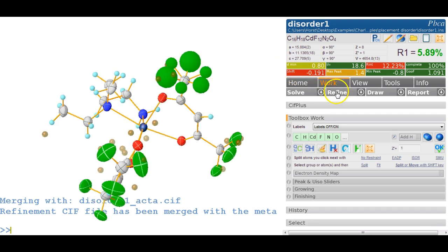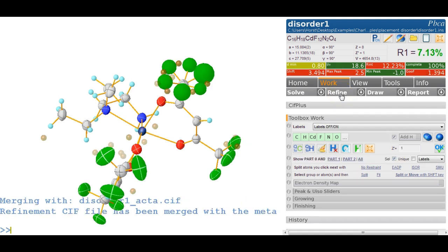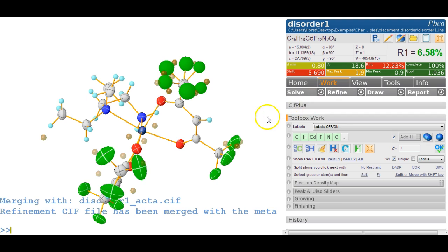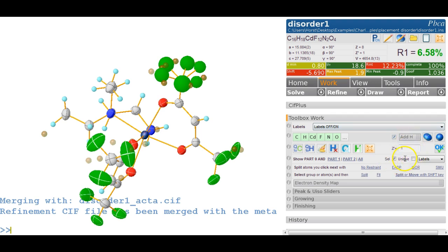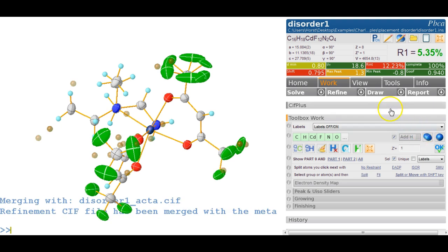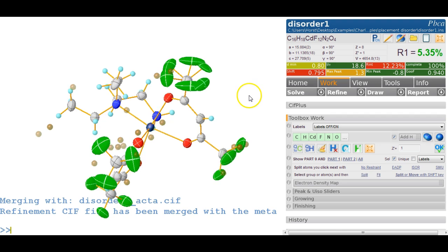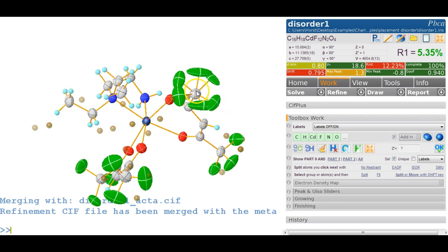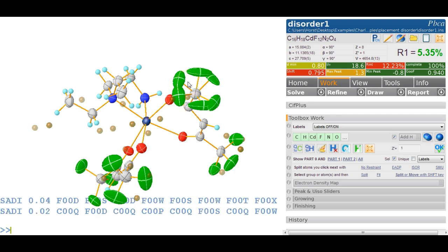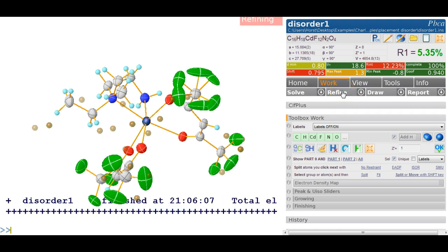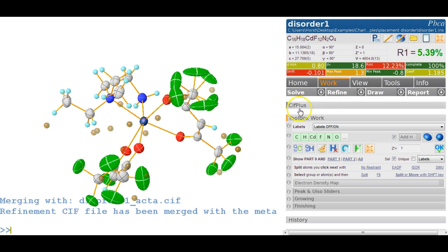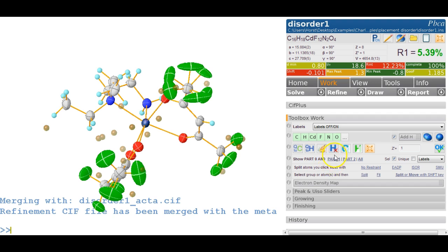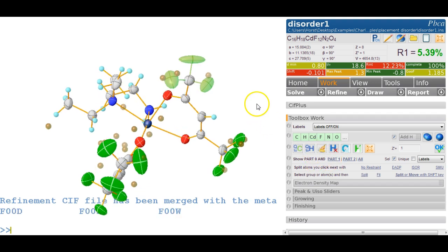Now we have the disorder set up and we refine it several times - the refinement works out really rather well. Let's go anisotropic by clicking on the ellipsoid button again. The ellipsoids are rather smeared out, so we need a couple of restraints. The first is a distance restraint: we click on the carbon and type SADI. This puts in a distance restraint from the carbon to the fluorine, and also the fluorine-fluorine distances within each group. After refining again, the effect looks quite good, but the ADPs are still not very good.